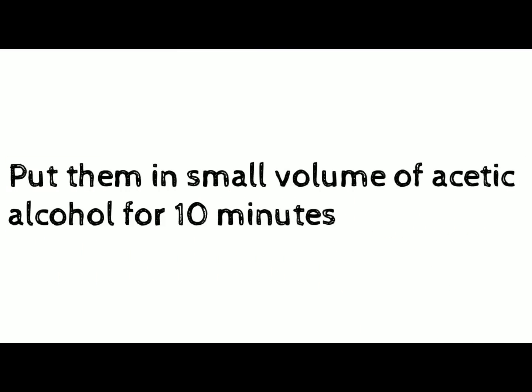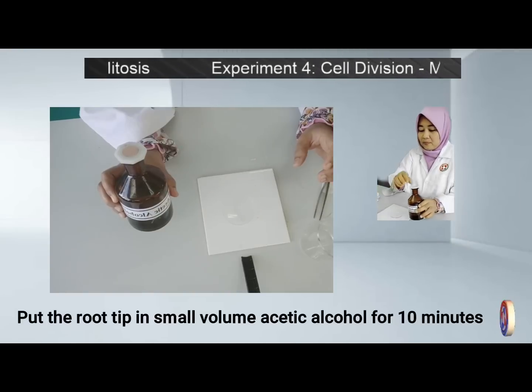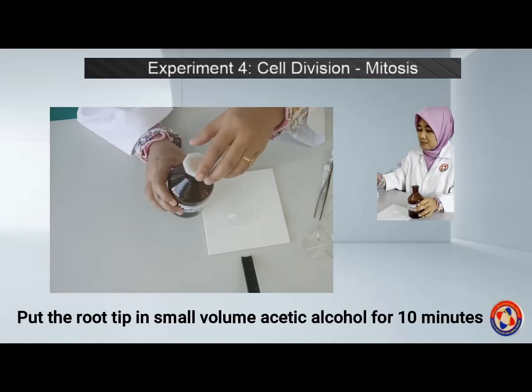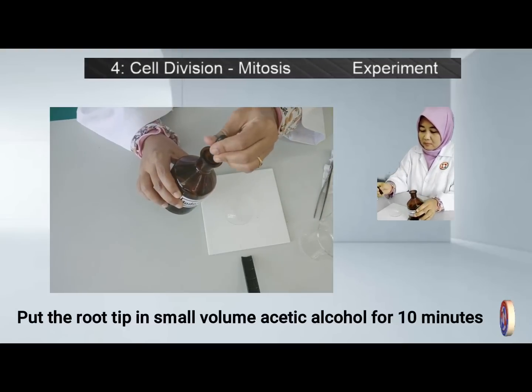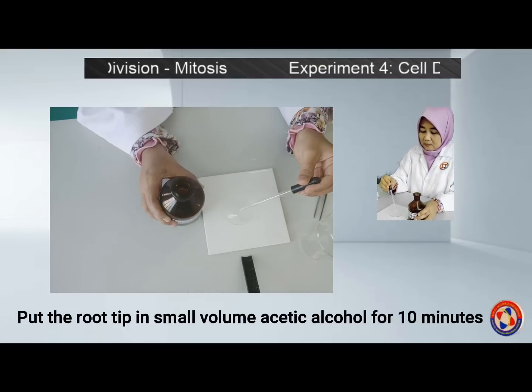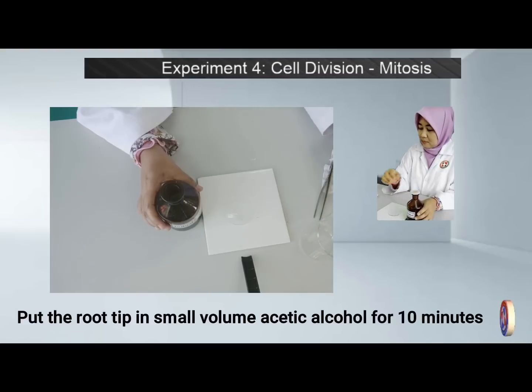Number two, put the root tip in a small volume of acetic alcohol for 10 minutes. There is no specific volume of acetic alcohol required — just make sure the root tip is properly immersed.